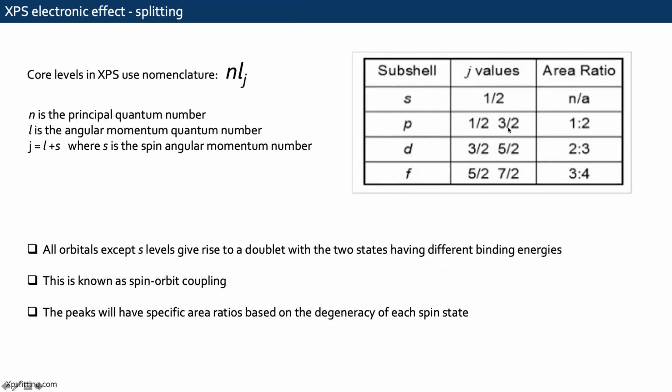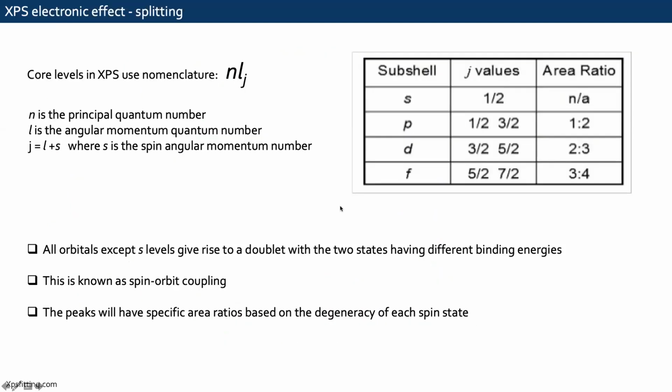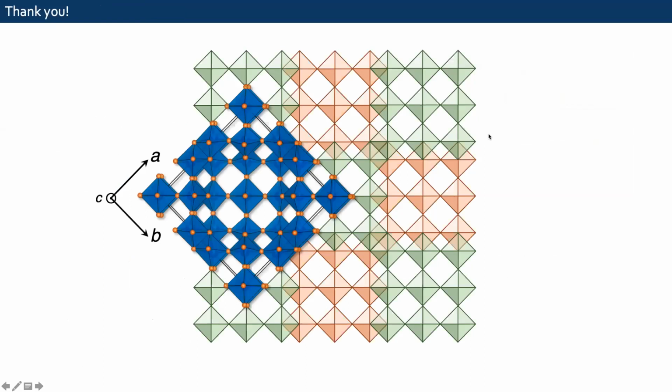So we do see 2 peaks, and they'll have a fixed area ratio. In this case, you can see that it's sort of a 1:2 ratio, which you can even eyeball, that it is following that rule. And so this is due to spin orbit coupling, and you just have to pay attention to that. But yeah, okay, cool. That was it.